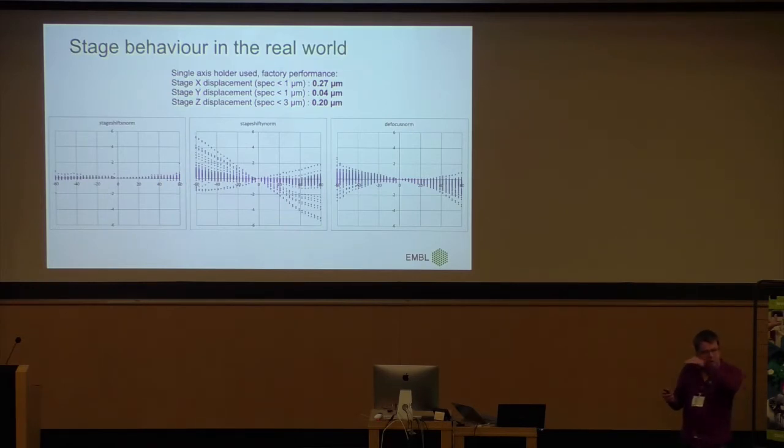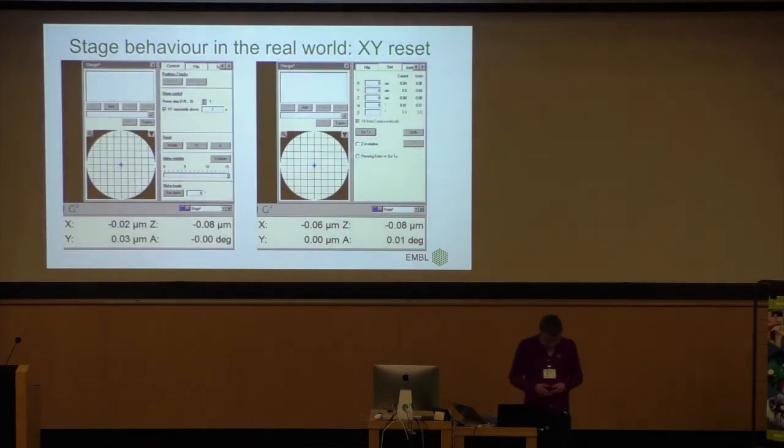I go to one spot only, don't change anything. You check it a couple of times, looks great. If you go over the entire grid with a real experiment, with a cryo grid that is wobbly and cold and everything, all bets are off. But it doesn't matter because I can just track everything properly and then you get everything in check.